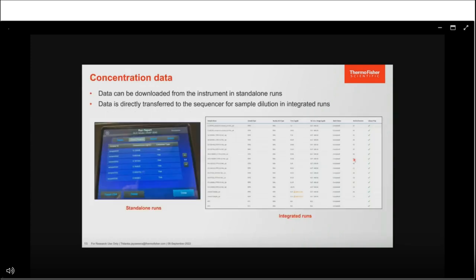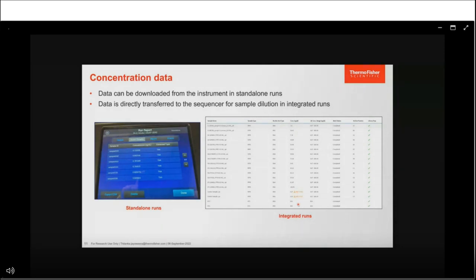Once the run is completed, quantitation results can be obtained on the instrument user interface in standalone mode, and the data can be exported to a USB. If the run is done in integrated mode, all concentration data will be available on the Torrent Server. If any concentrations are below the assay requirement, they will be flagged as quantity not sufficient, so the user can decide whether to move forward depending on their needs.